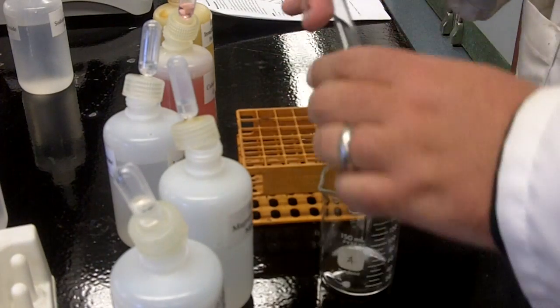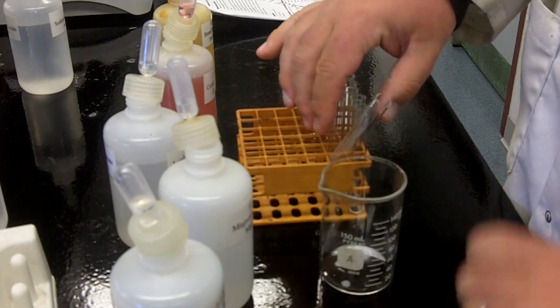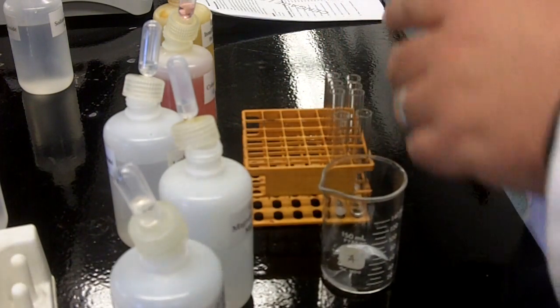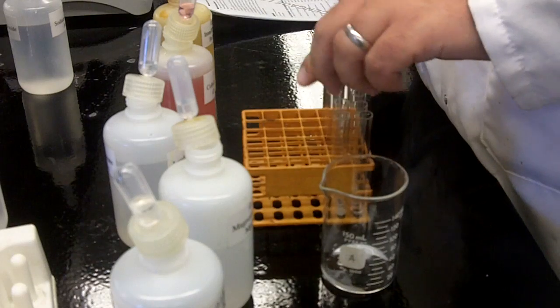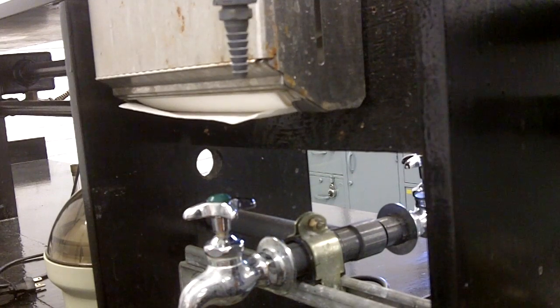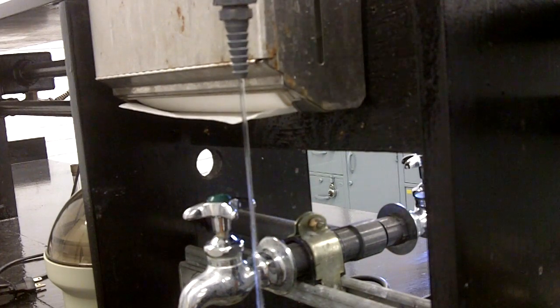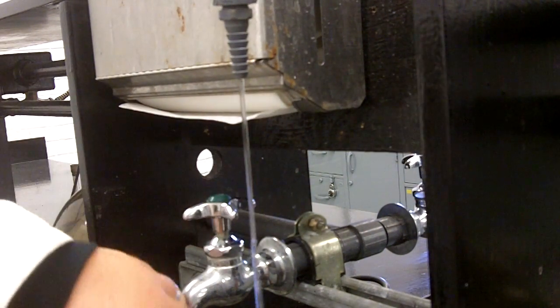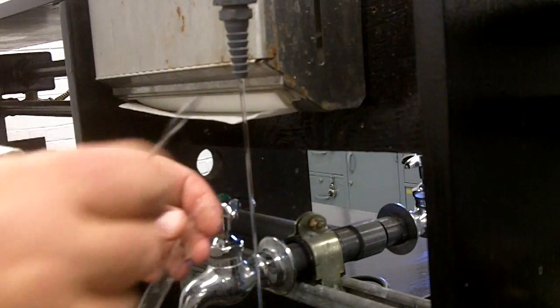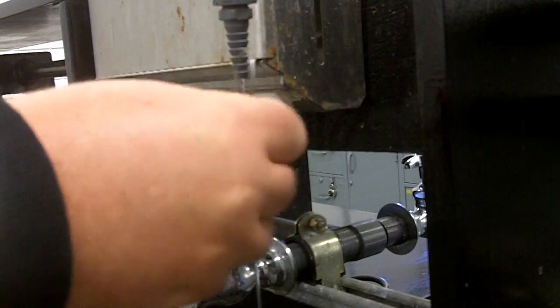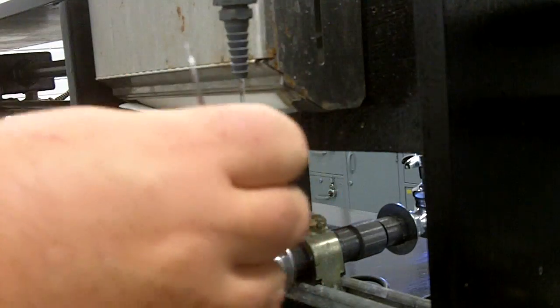When you're done with a particular rack, collect all the waste into some sort of waste beaker at your bench. You'll have potentially 20 to 24 test tubes. Try to get most of it out that you can, and then you can just wash the rest in the sink with the DI water. We have appropriate test tube brushes that are perfect for those things. Just wash them out real well and that'll be fine.